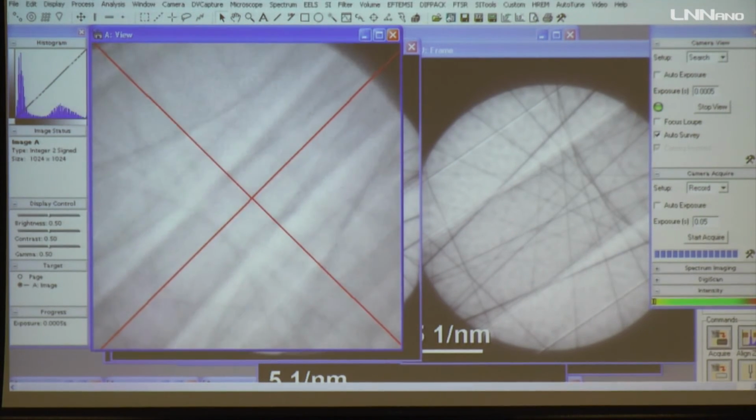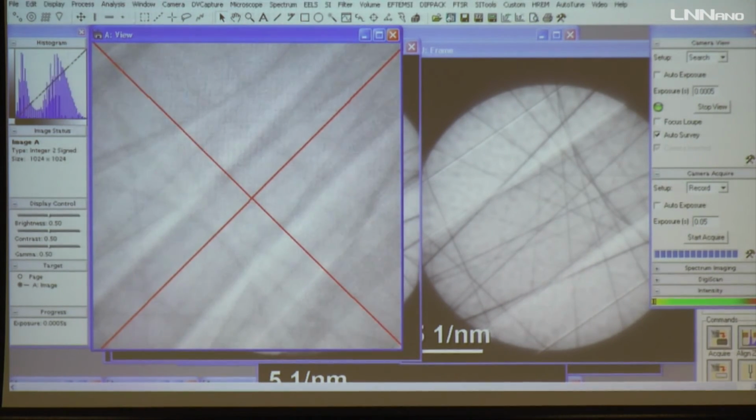So here, for determining the thickness, yesterday in class I think I told you that if you focus the beam on your sample and leave it to build up contamination, it will grow on the top and bottom of the surface, and you tilt the sample and measure the thickness. I mentioned that, but I strongly recommend you not to do it that way because you're destroying your sample.